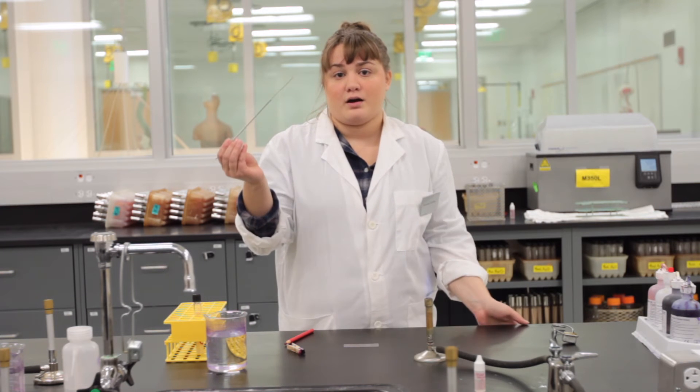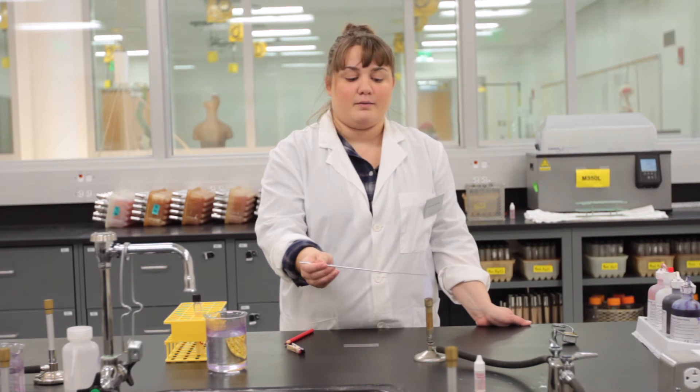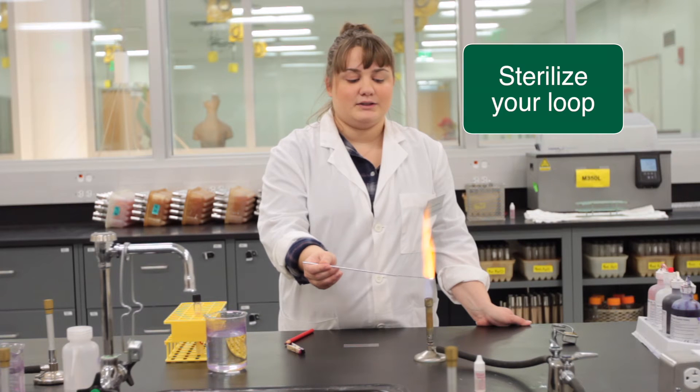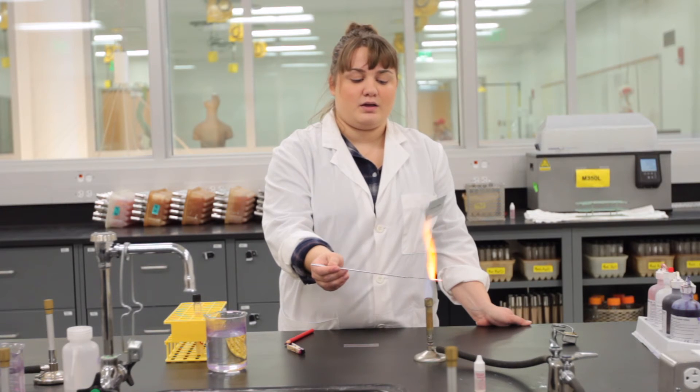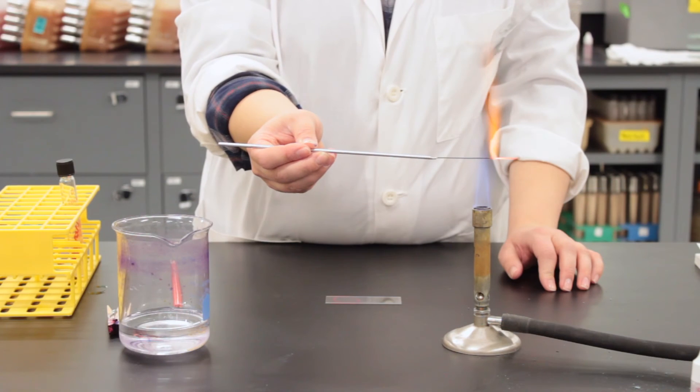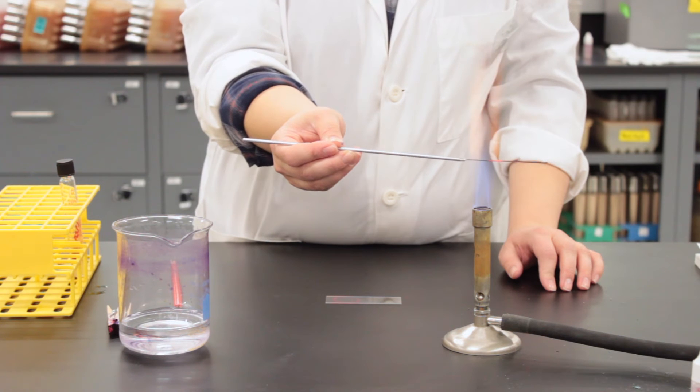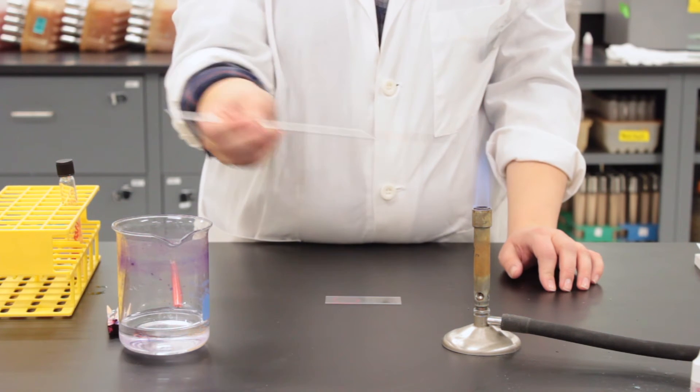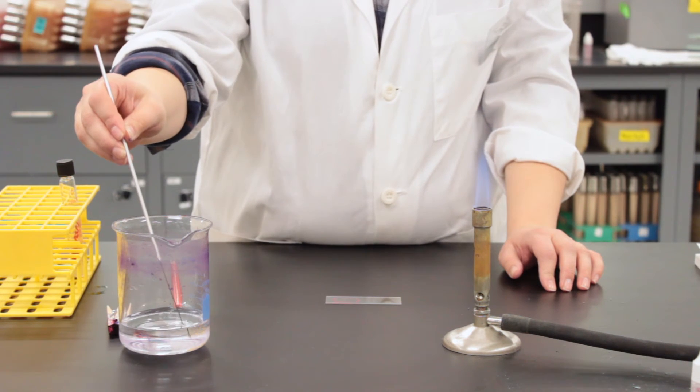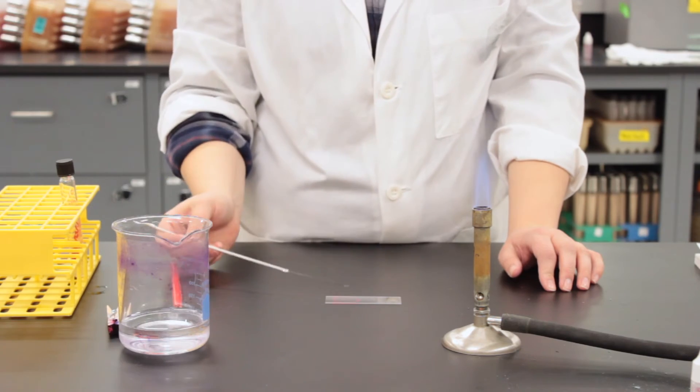We will take our inoculating loop and sterilize it. Make sure that the inoculating loop is completely sterilized, and then you will go to your water. Take a drop of water and put it in the center of the circle.